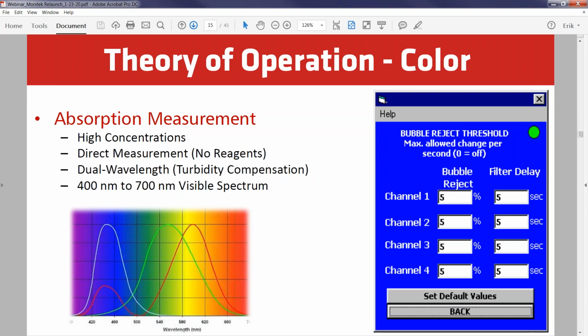So let's just talk about an easy one that everybody has probably experienced at some point in their life, which is platinum cobalt color units, or APHA, or Hazen color units. That's all the same. That is all the time done between 400 up to about 460 nanometers. That's your measurement channel. And this looks at the color, what I call the wheat color of a liquid. So imagine if you take kerosene. Kerosene, for most parts, is water white. It looks completely clear. And then imagine if you had a glass of gasoline.